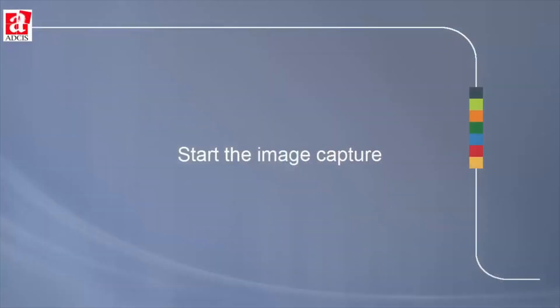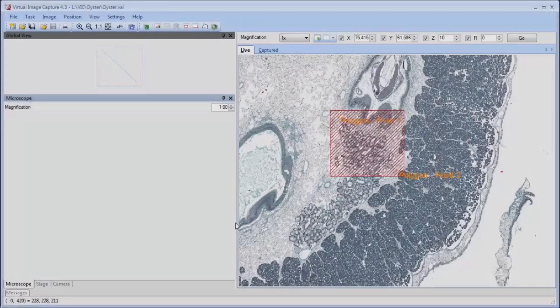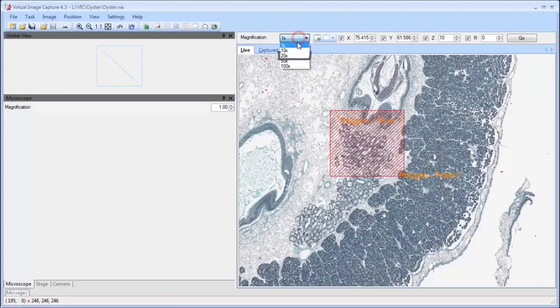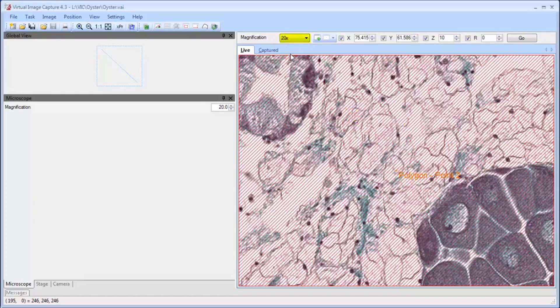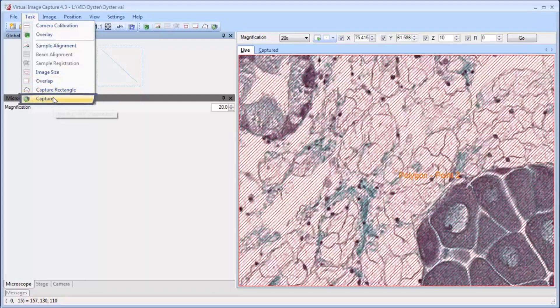To start image capture, first reselect the magnification lens as defined in the project. If the microscope turret is not motorized and controlled by the software, then select the associated lens. Launch the capture process by selecting the capture command in the task menu.